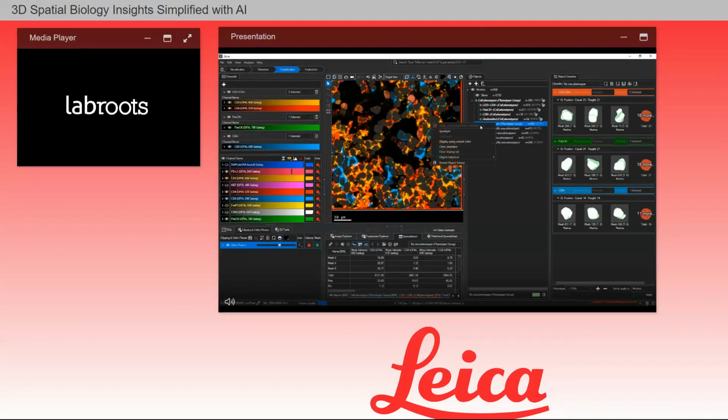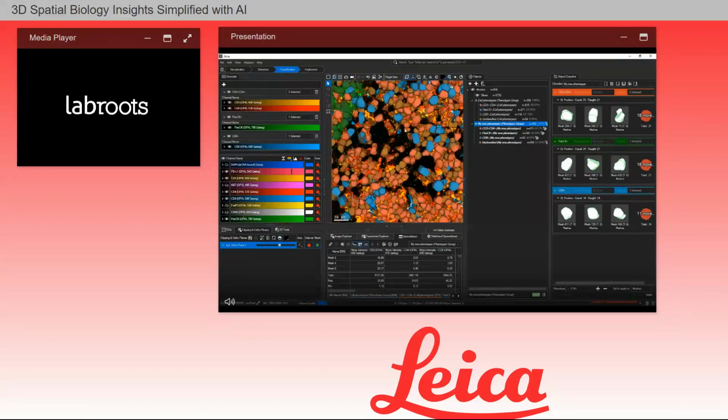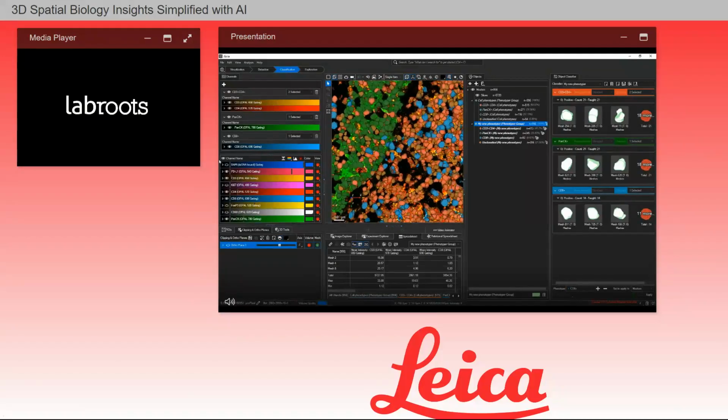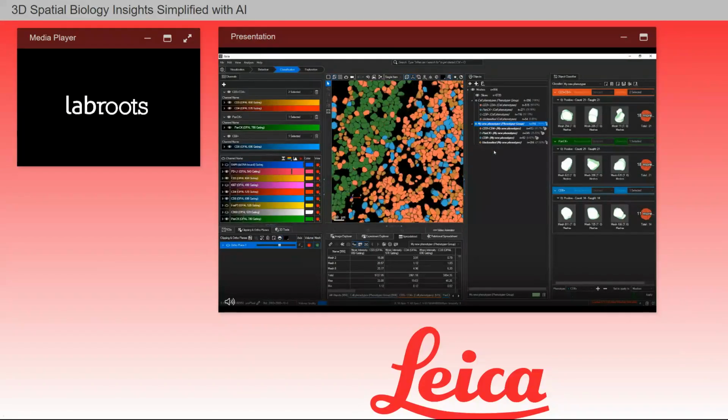We can now look at the new phenotypes. I am going to turn off the ortho slicer, and I am going to toggle the object display so you can see how the phenotyper output corresponds to the original image. Next to the subsets in the Objects tab, you will see the count of cells for each phenotype and its percentage of the whole object set.